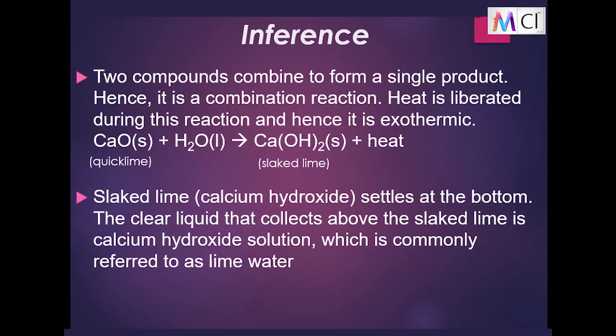Inference. Two compounds combine to form a single product. Hence, it is a combination reaction. Heat is liberated during this reaction and hence it is exothermic. Calcium oxide plus water gives calcium hydroxide plus heat energy is liberated.